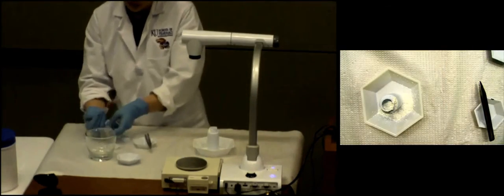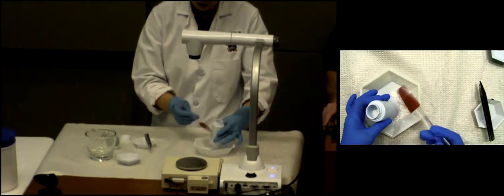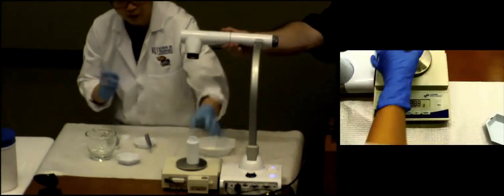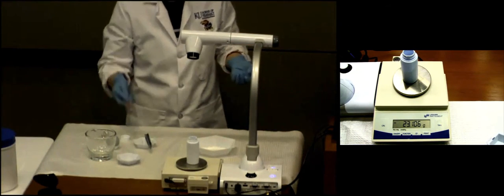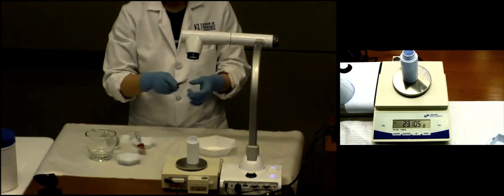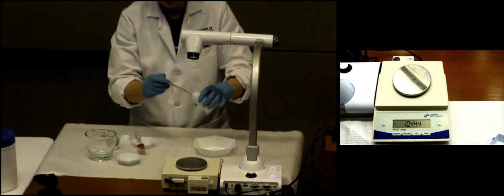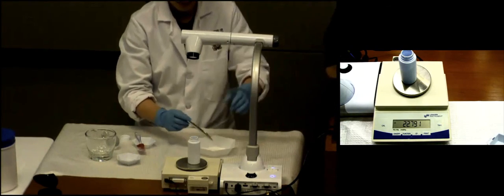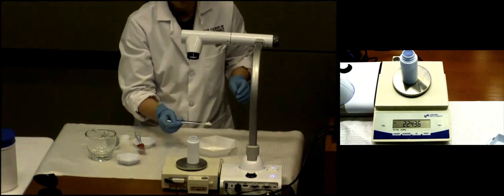Okay, all right. I'm not sure whether I have enough powder or not. How do I know? I have to check that out. So I want to clean my bottle, make sure it's clean. And let's see. Wow, do I have enough? So what's the maximum, does she have too much? Remember, we can't overdo that. So I'll do this here real quick so I can remember. What is 22 times 1.05, right? That would be the maximum she could have, what'd you get, 23.1? So we don't want to go over 23.1. I'm happy with that. Good.